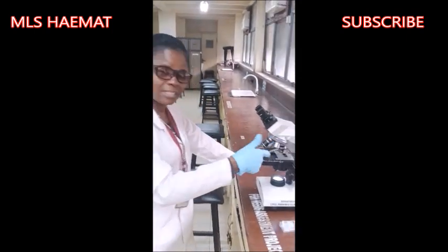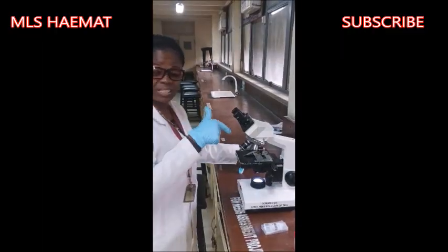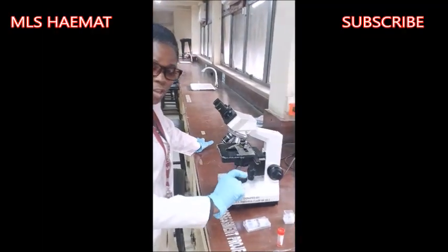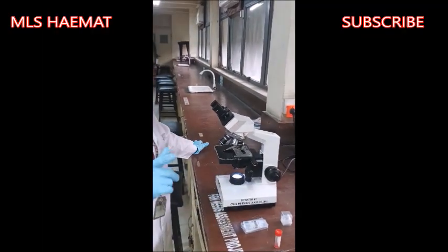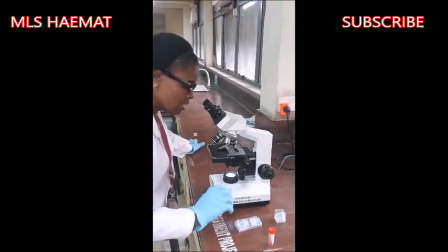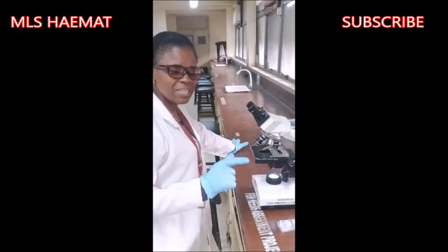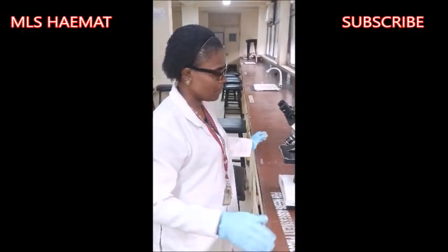By the time you turn the nose piece and you put the ×10 objective in view, all you need to do is just to turn the fine adjustment this time around, not the coarse adjustment. Turn the fine adjustment forward. Just move it forward. By the time you move it like 3 or 4 times, definitely you will get the focus of the ×10 objective.